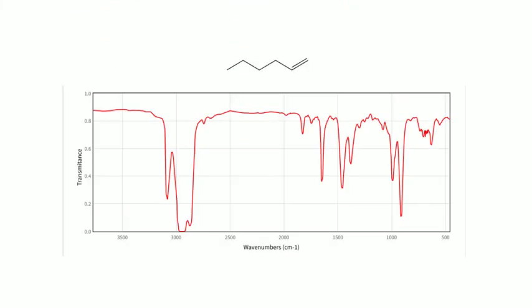Let's look at another one. This is the IR for 1-hexene. This wavelength at around 1650 is the carbon-carbon double bond. And this wavelength at 3100 corresponds to the vinyl hydrogen.